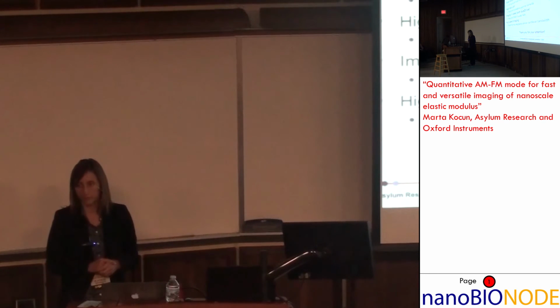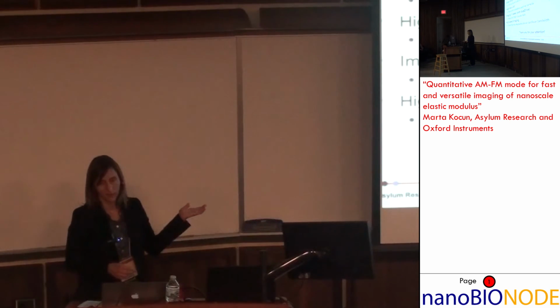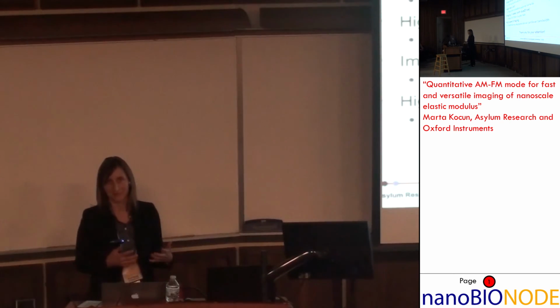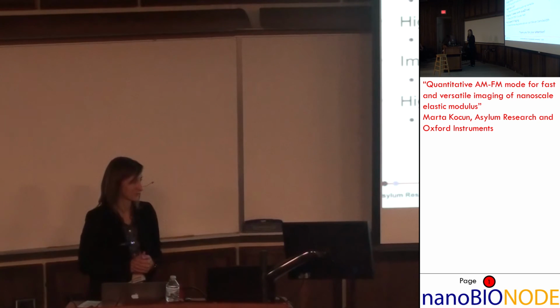So we did a little bit of that, but we haven't tried enough to actually go ahead. One example is some rubbers. We can see differences, maybe not in the frequency image, but we see it in the dissipation image. So this is addressing your question. But we have to do a bit more to be comfortable with the calculation that has to be done in order to get the modulus. So that takes more time.